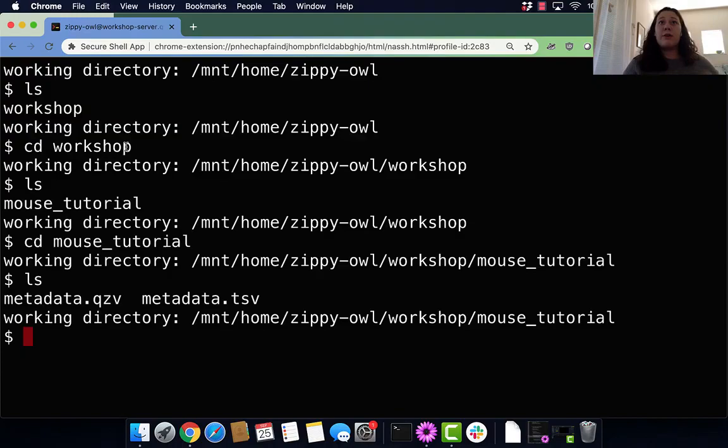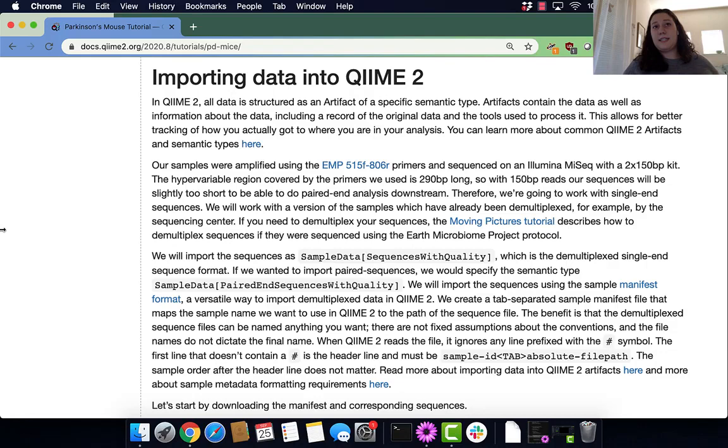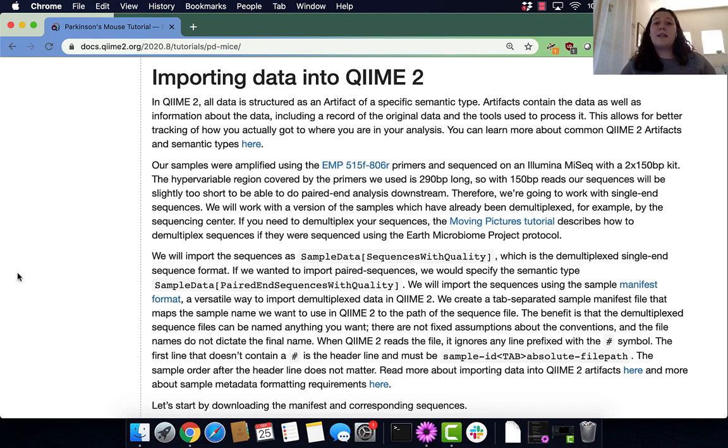Now I'm in there, so let's check out the data. You have both of your metadata files from the last section. Now we are looking to import our data using a manifest file. Importing data is probably one of the hardest steps, but we need to get our data into QIIME 2.